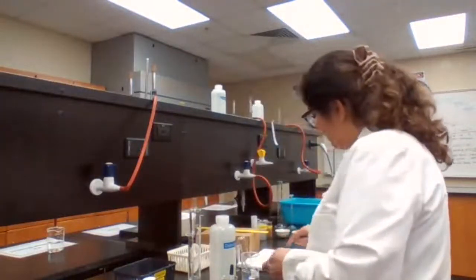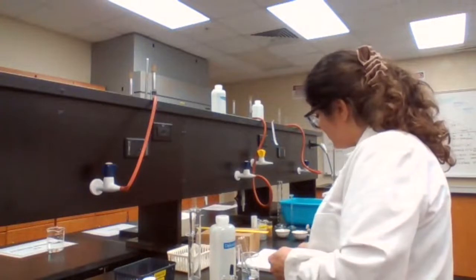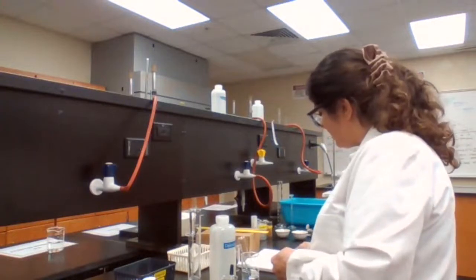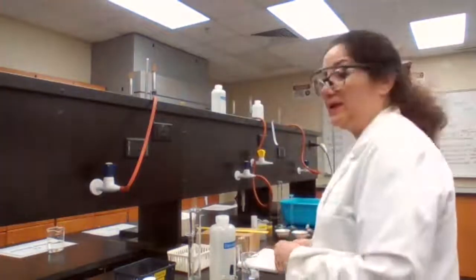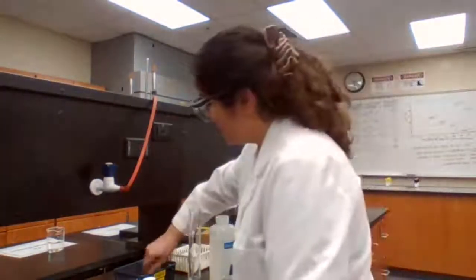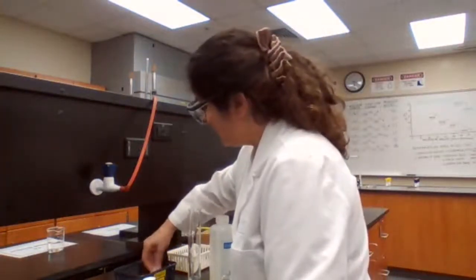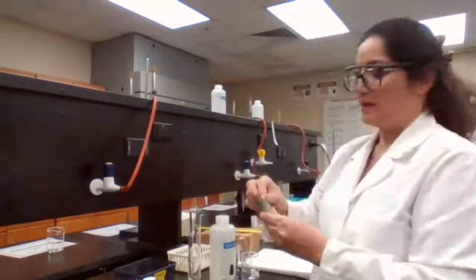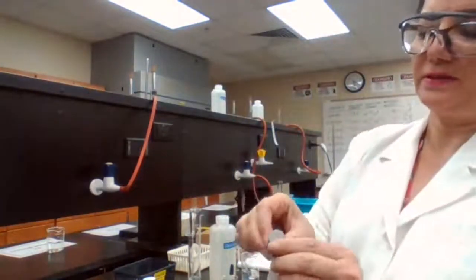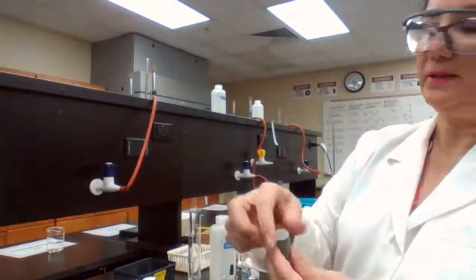Next is the irregular shaped solid. The irregular shaped solid that we are going to use is going to be the cylinder shape. This is metal. It's not a perfect cylinder. There is something coming up here.